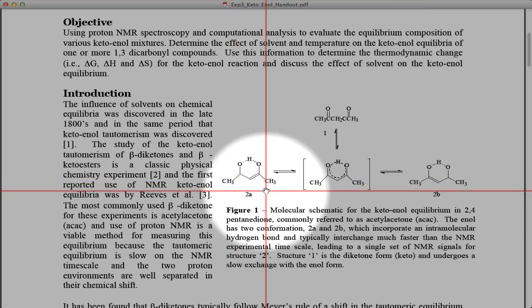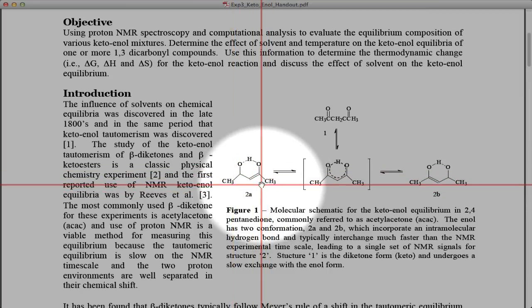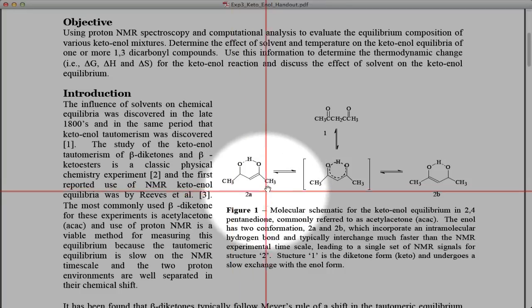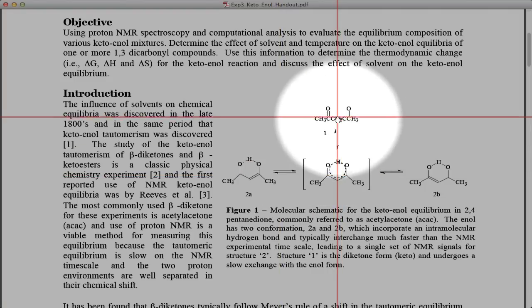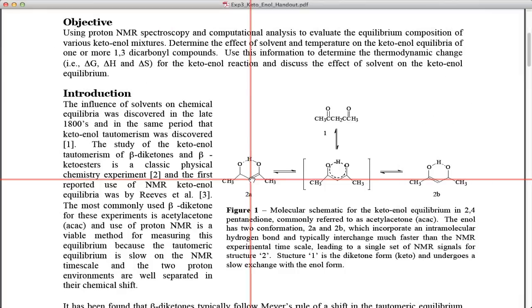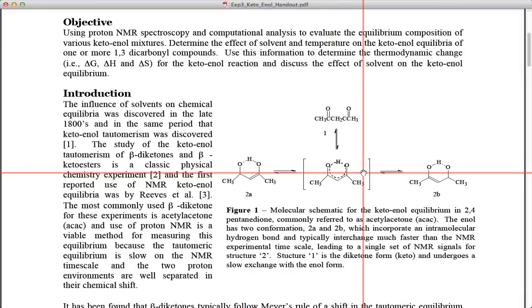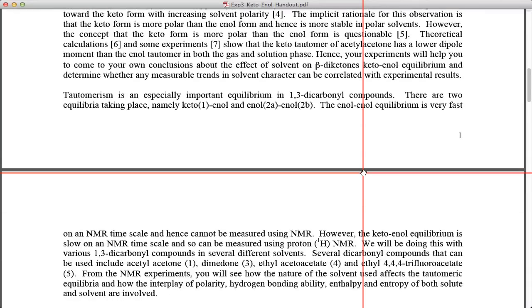We go from having a methylene here to having two separate protons, a CH and a basically acidic proton that are shifted way downfield or to higher ppm values than this methylene would be. We still have the methyls here however they will be slightly shifted as well. NMR has high enough resolution to resolve these enol methyls from these ketone methyls and it easily resolves the difference of how this methylene turns into an acid proton and a CH.